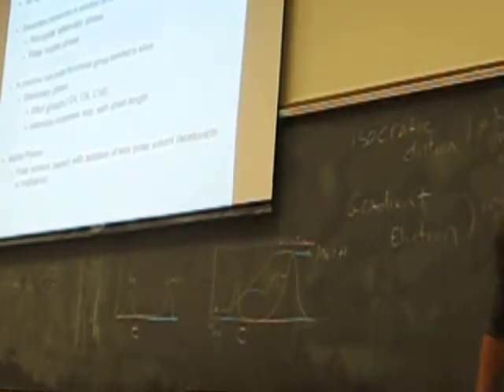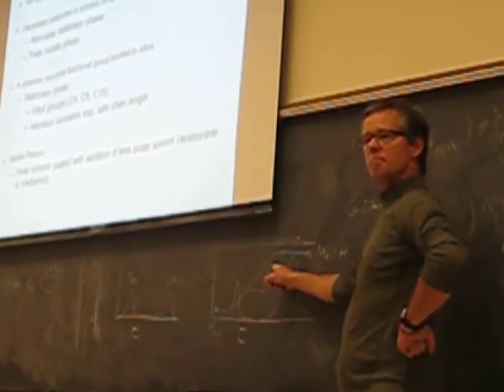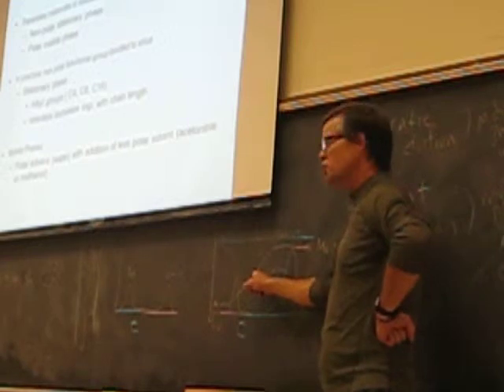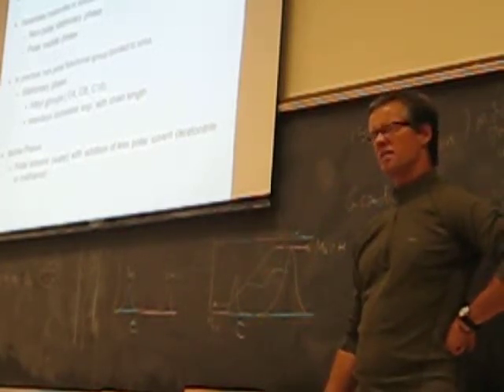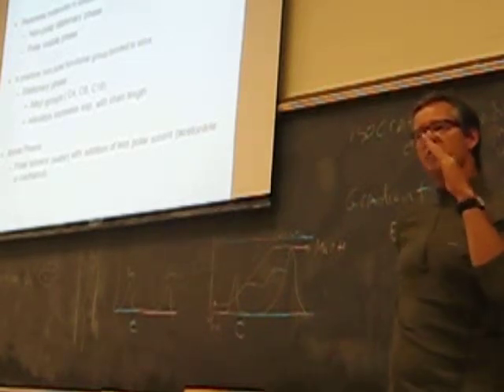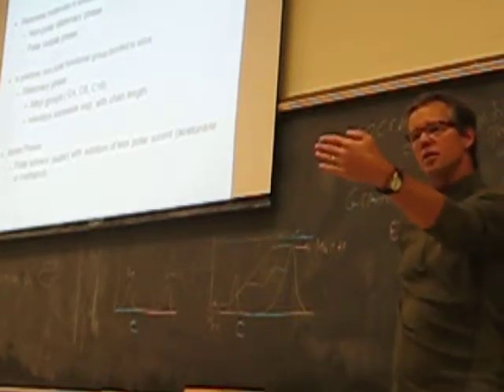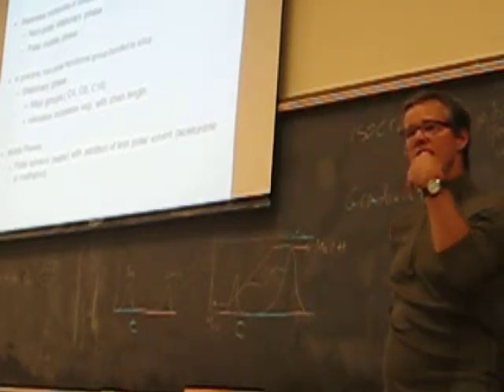So rather than relying on time to eventually make everything elute out, this is just exaggerating the separation? It's both. Within each composition, it's relying a little bit on time, but once the mobile phase character changes, the relative partitioning changes dramatically. That's what you're banking on.